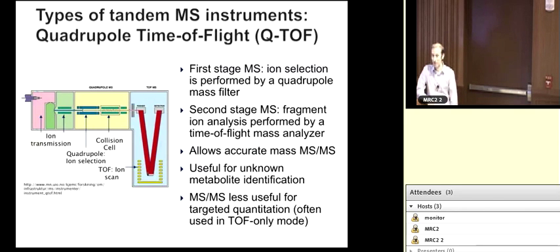So my recommendation would be to consult with the core wherever you do your metabolomics and make sure you have a plan in place to standardize your runs across batches and across sites, and then a good statistical plan in place to do that normalization and look at things the same way. But you're right, the platforms are still somewhat different, and you may get a somewhat different profile across sites. There is still a way to go to bring all of this onto some sort of absolute standard as a field, and whether we'll ever get there or not, I'm not certain. It's a good point, though.